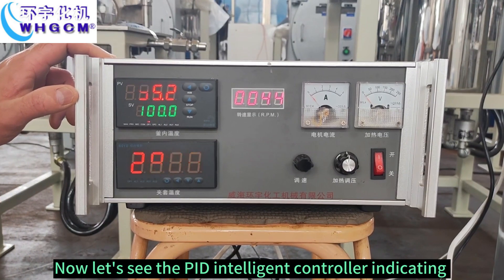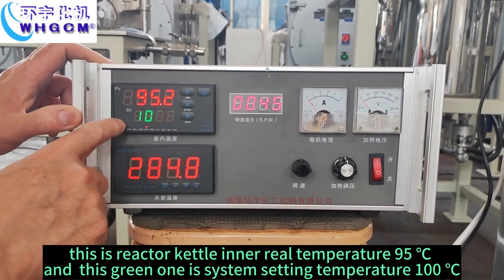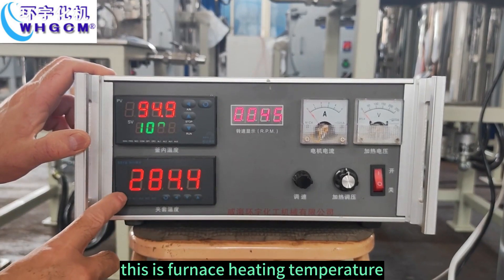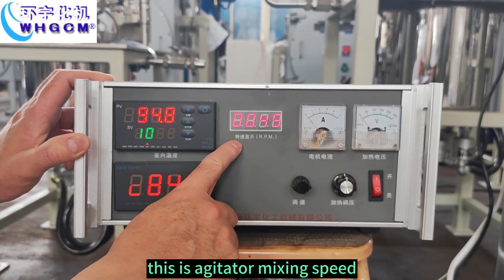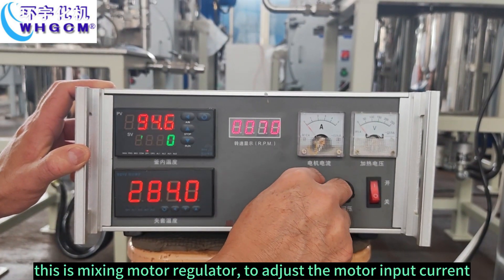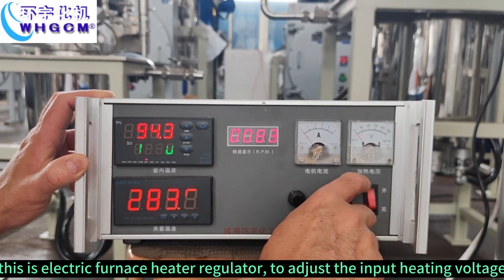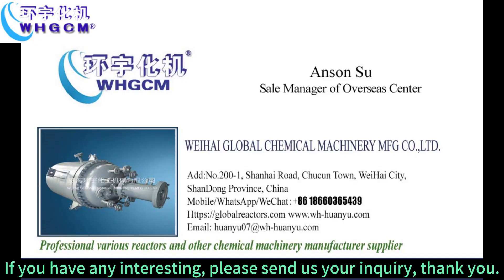Let's see the PID intelligent controller. This one is heat heating. This is reactor kettle inner real temperature, 95 degrees. And this green one is system setting temperature, 100 degrees. This is furnace heating temperature. This is agitator mixing speed. This is mixing motor regulator to adjust the motor input current. This is electric furnace heater regulator to adjust the input heating voltage. And this is power switch on and off.